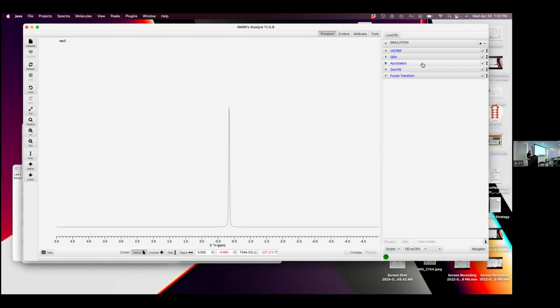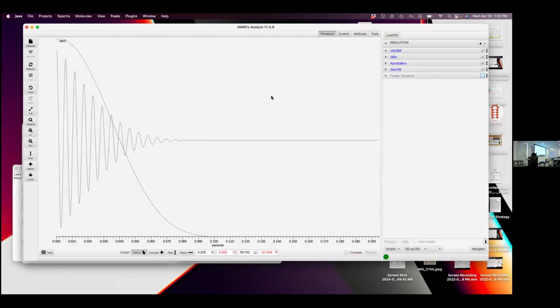So we're now going to shift into something that's become a popular topic these days. If we went back and looked at the signal, I don't unfortunately show each individual measured point, but they're measured at uniform positions, which you can say in some ways is peculiar to NMR. Often if people are doing experiments, like a titration, you don't measure 1 micromolar, 2 micromolar, 3 micromolar exactly. In NMR, when we enter the signal in the direct dimension, we measure uniformly spaced data points.